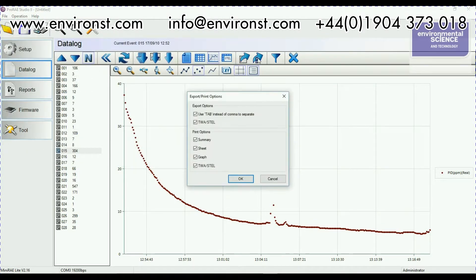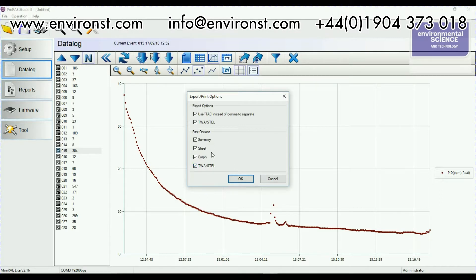The other thing that I can do is hit this one and then you've got an option to have all of these different things exported. You can have it as a tab instead of a comma separated file if you would like.